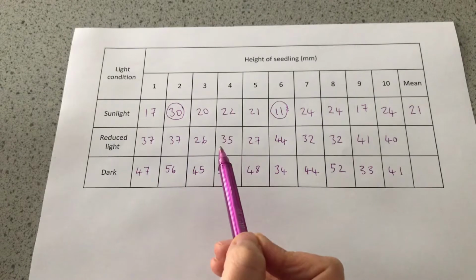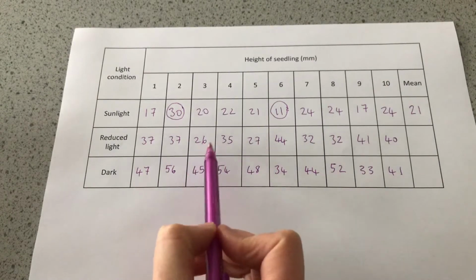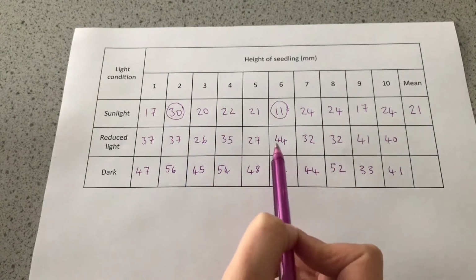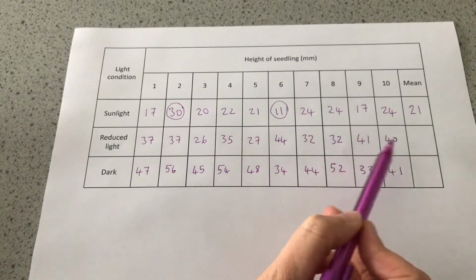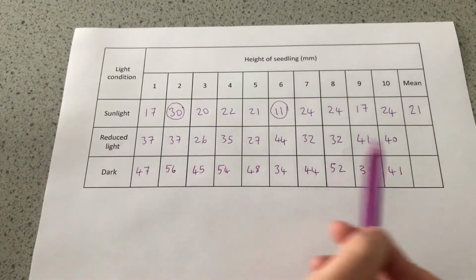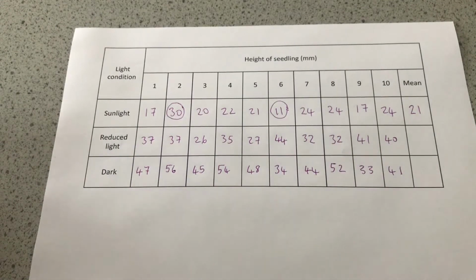Quite a big range, but I don't think I can call 26 an anomaly because I've got a 27 as well. I don't think I can call 44 and 41 or 40 anomalies because they're all quite similar together there. So whilst we've got a big range, I don't think there's any obvious anomalies.